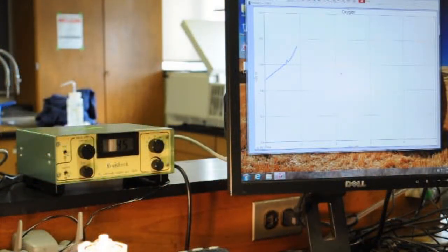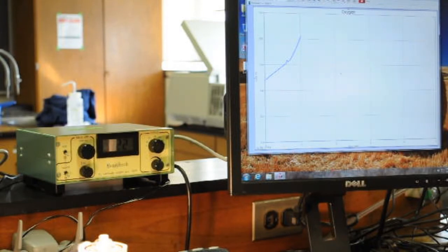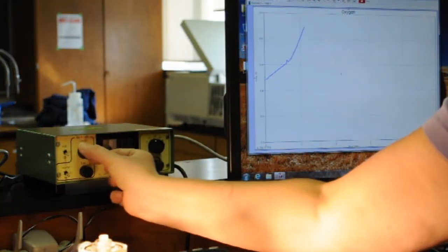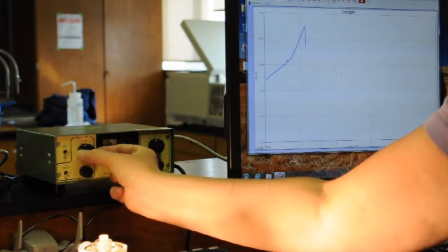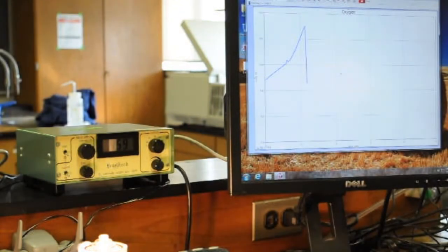Note that the y-axis on the graph is from 0 to 1 volts. Sometimes the O2 exchange rates are quite rapid and the data will quickly move outside this scale. Use the backoff adjustment, the knob on the top left of the control box, to adjust the output so that it stays within 0 to 1000 millivolts.